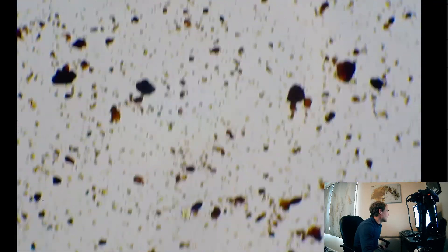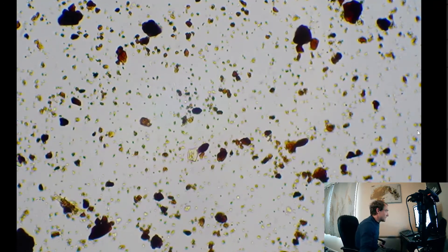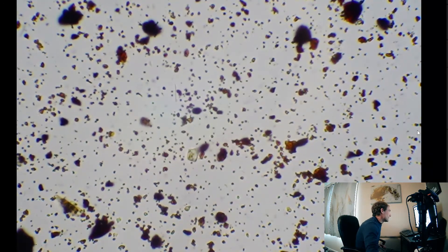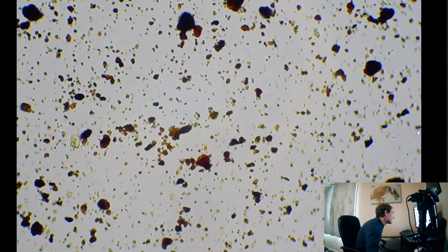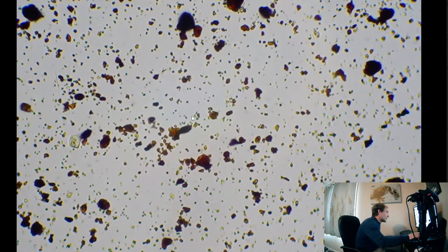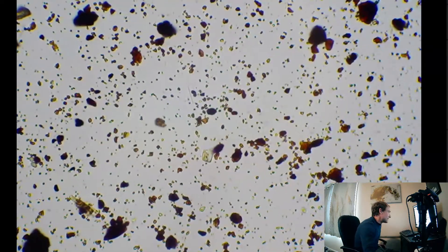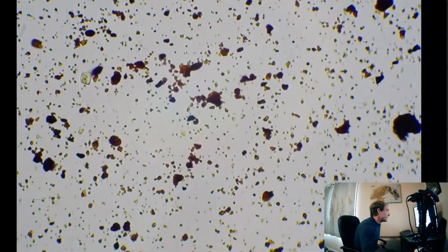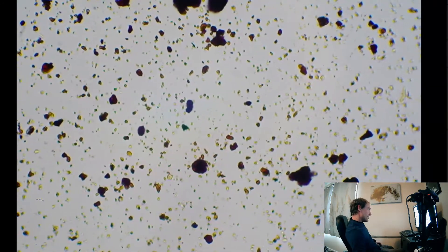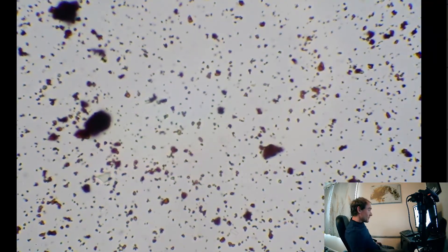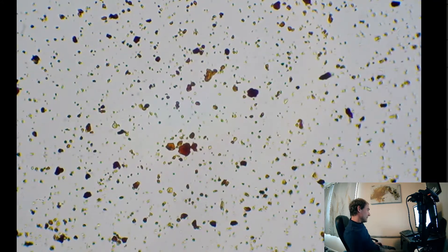Got one little strand that seems to be wiggling and moving around. So we got some different forms and types of bacteria. I just saw an S shape over here, but that could have just been the lens refracting or a couple of them together. I thought it was a little snake-like bacteria. Well, one thing's for sure, they like this food source and they are happy critters down there. So that's a good sign.